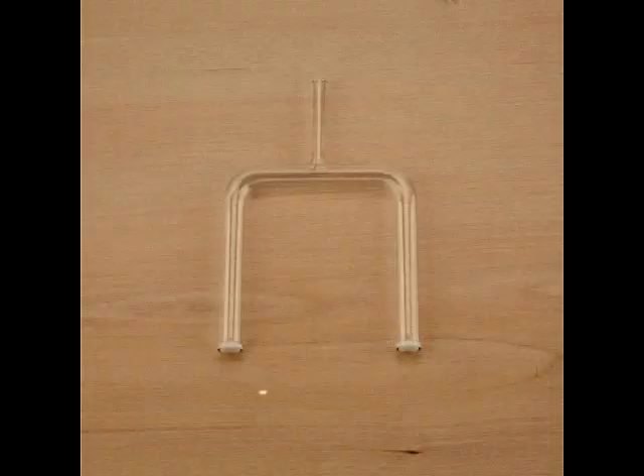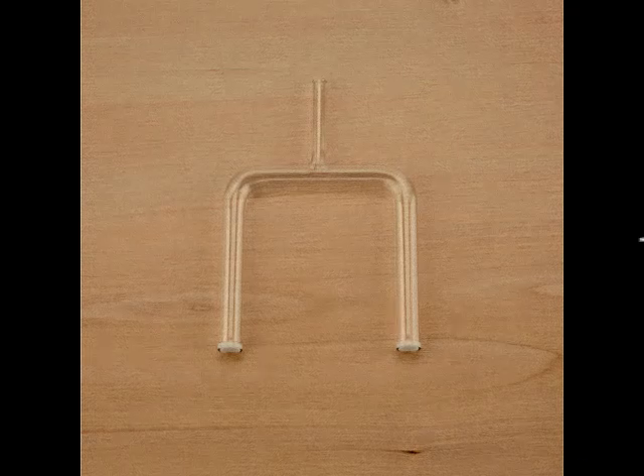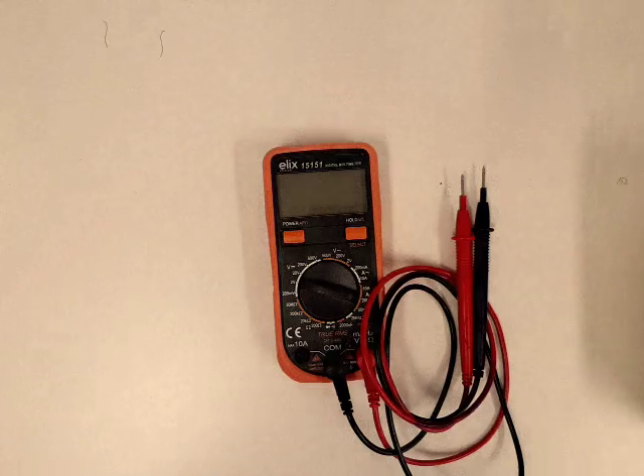Then, to transfer ions, you will need a salt bridge. You can choose any salt, such as potassium chloride. Last but not least, you may use a multimeter to check if everything is working fine. Thanks to the multimeter, you can check if the current is okay and see what the value of the current is.